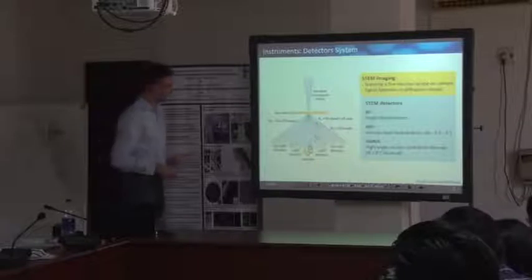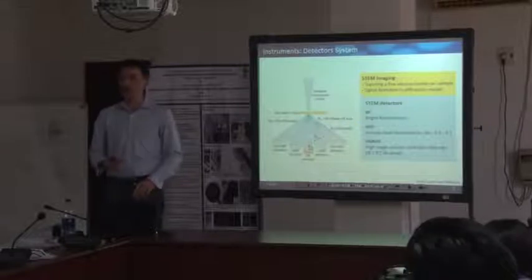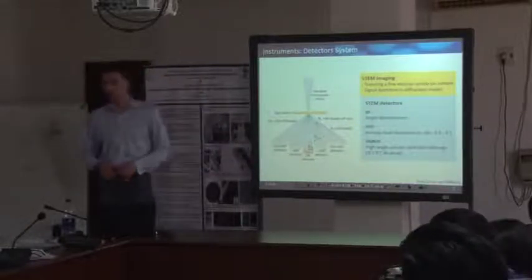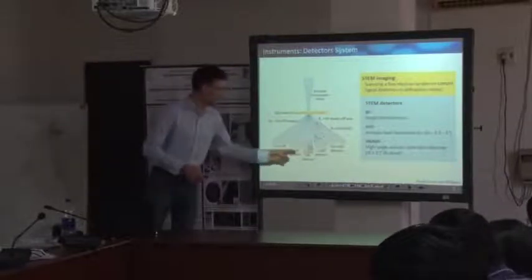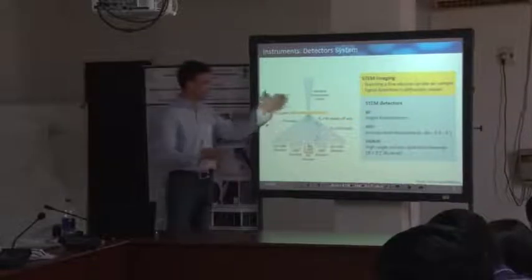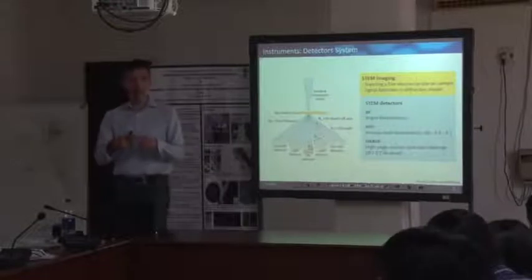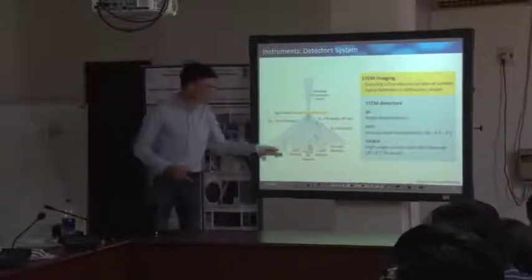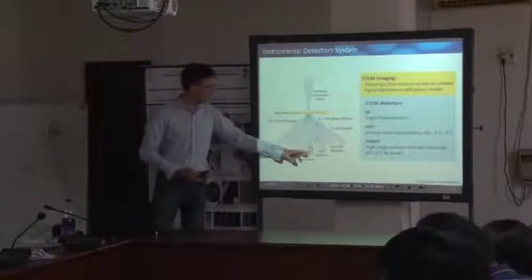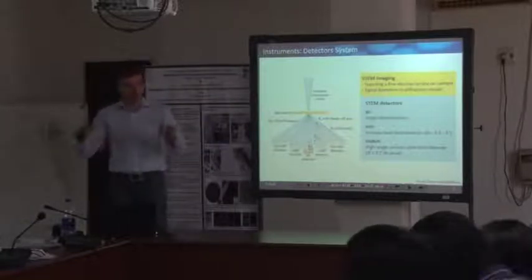Closer to our direct beam, we have a so-called annular dark field detector. This is the detector with which you can also observe diffraction contrast, because, as you will see, we currently work in diffraction mode, meaning we don't work in any kind of imaging mode, so we just image our back focal plane onto these detectors far below the projection lenses, where we can record the direct beam or some of these scattered reflections on the detector.